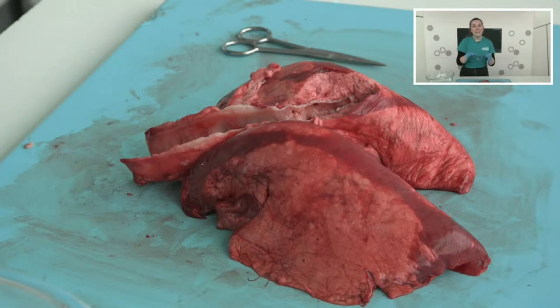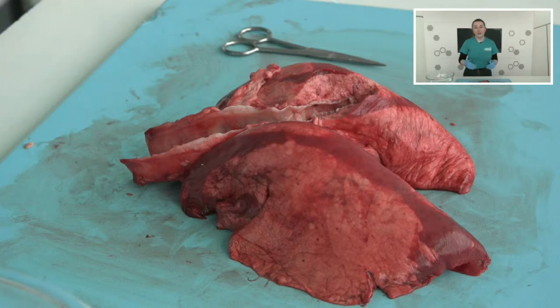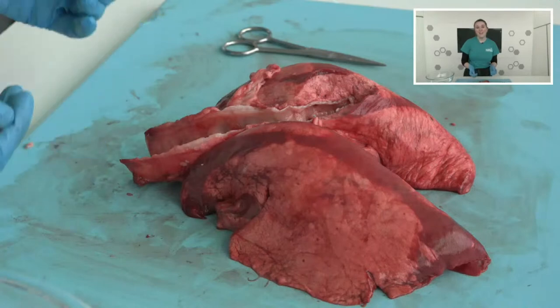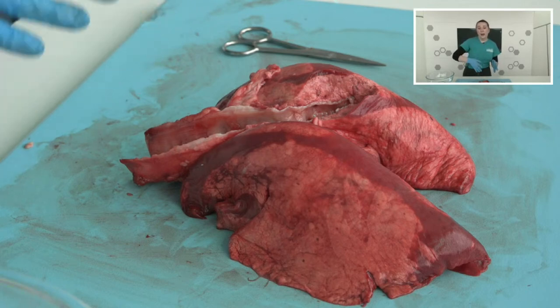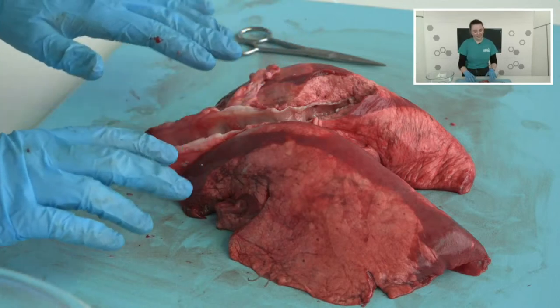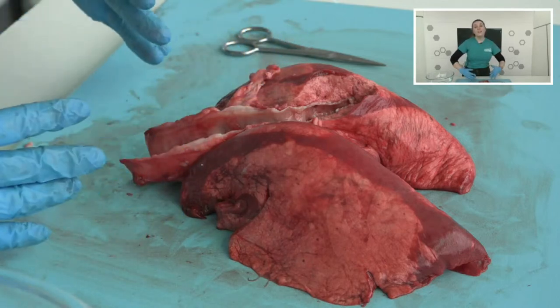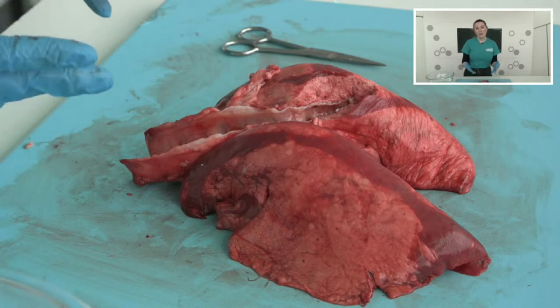The alveoli are absolutely covered in blood vessels because this is where a really important process happens — this is where gas exchange happens. As we talked about, oxygen doesn't just go to the lungs. We take in oxygen through our lungs so we can send it to all the different organs in our bodies. At the alveoli is where the oxygen actually goes into our blood system, travelling through the blood to all those other organs by diffusing — just kind of oozing through the alveoli. When we breathe out, we're breathing out all the stuff we're not going to use — the waste — and that is in the form of carbon dioxide.